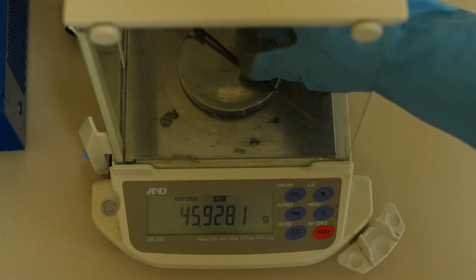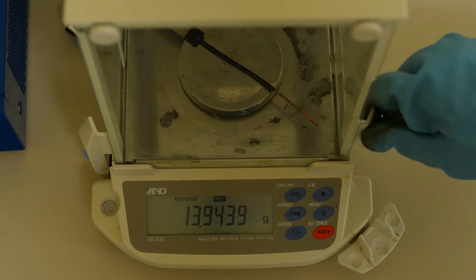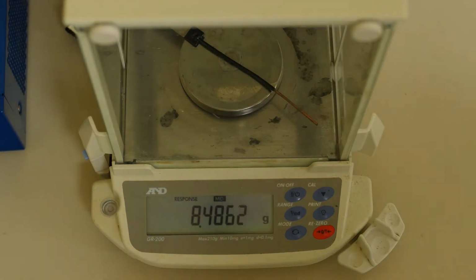The mass of all 3 coupons has been recorded and provided to you in an Excel spreadsheet on LMS, along with the initial masses.